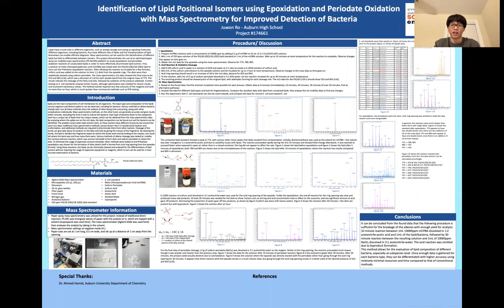Regardless of that, the method overall nevertheless works, and it can be used as an alternative for conventional methods like PCR that take up to 3 days to complete. This, on the contrary, besides the bacteria culturing time, only takes at most 40 minutes, if done quickly.